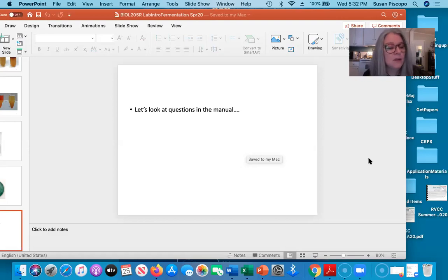Remember, in the MR test, because methyl red is our indicator, a yellow color is negative. So our control is going to stay yellow. For the VP test, a negative is no red ring. So our control tube should show no red ring at the top.